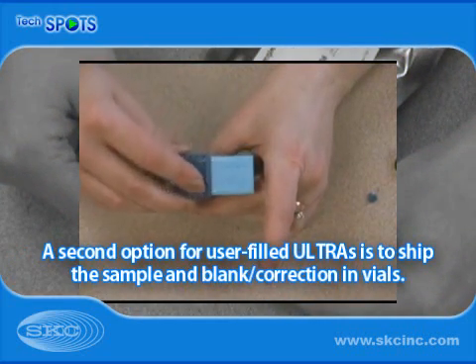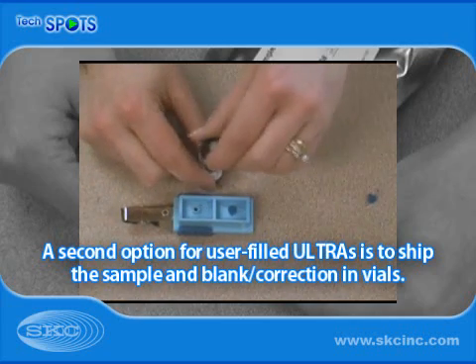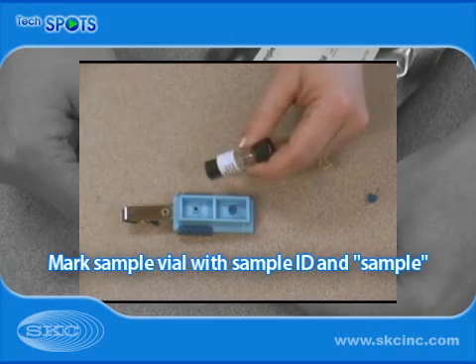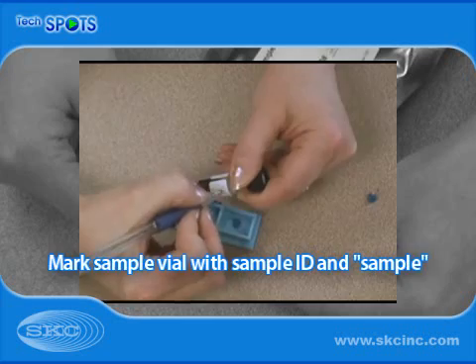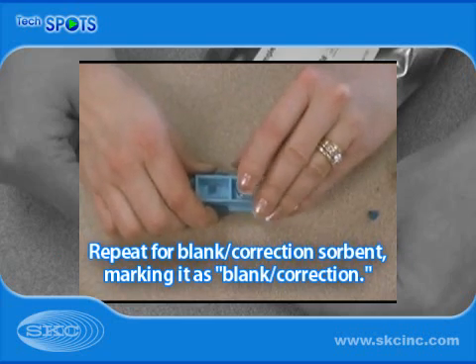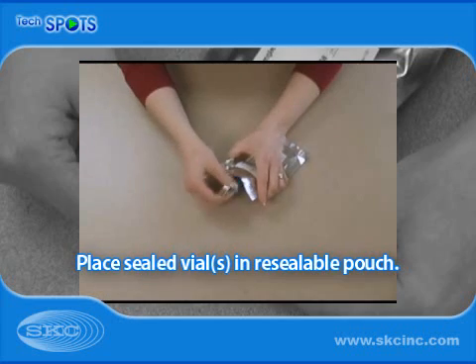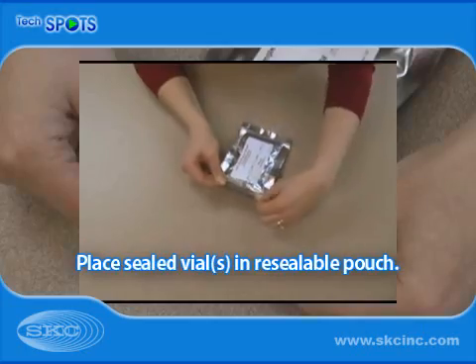If utilizing a user-filled sampler, a second option is to transfer sorbent from the sampler housing to a vial. Mark the sample vial with the sample ID and the word 'sample.' Repeat for blank correction sorbent if desired, marking the vial as 'blank correction.' Place vials in the pouch and seal.